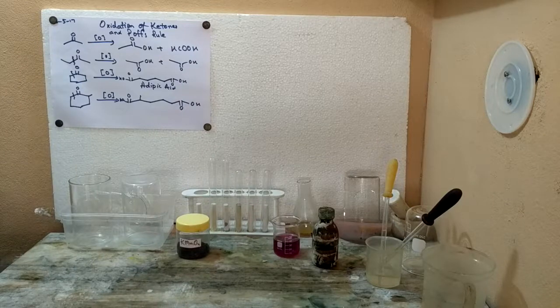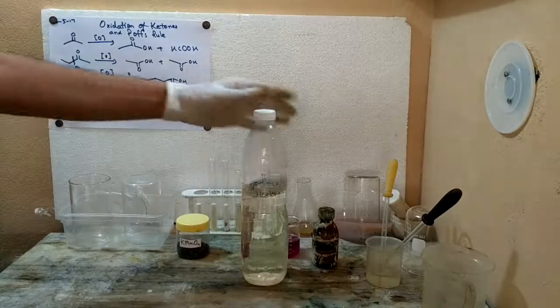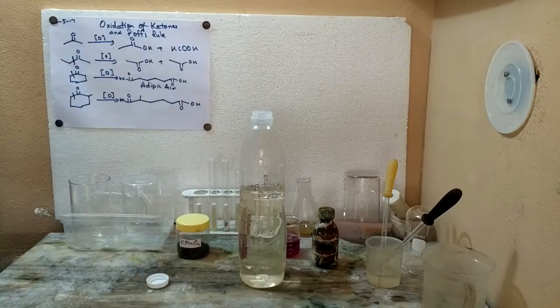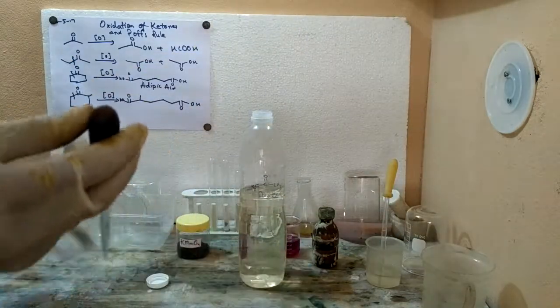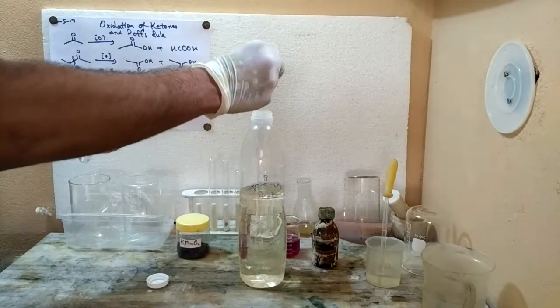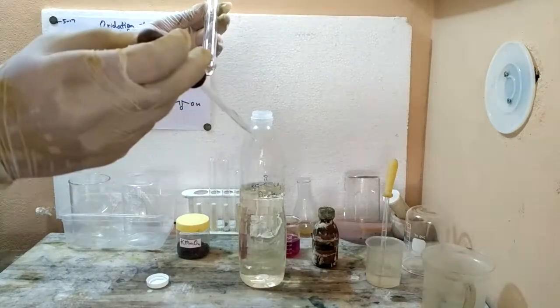So let's start. You need to take a test tube and, using a dropper, add some acetone to the test tube. I feel this is enough.